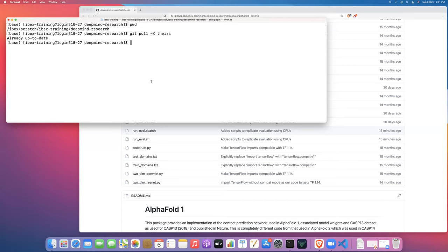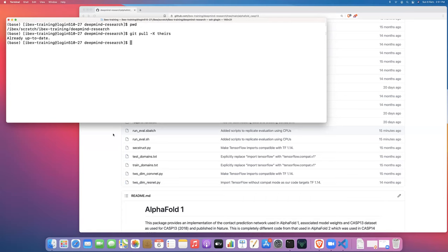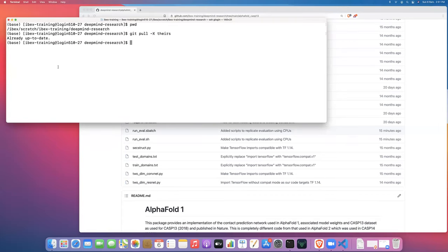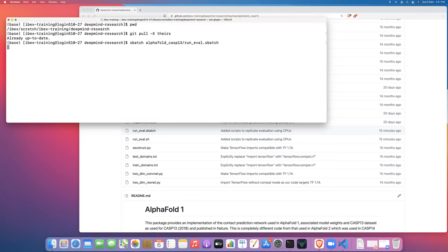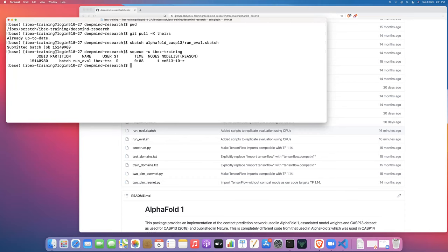Now all we're going to do is use sbatch to launch the AlphaFold run_eval.sbatch script. We'll just hit enter, and there — our job has been submitted. Let's just check that it's running, and it is running.